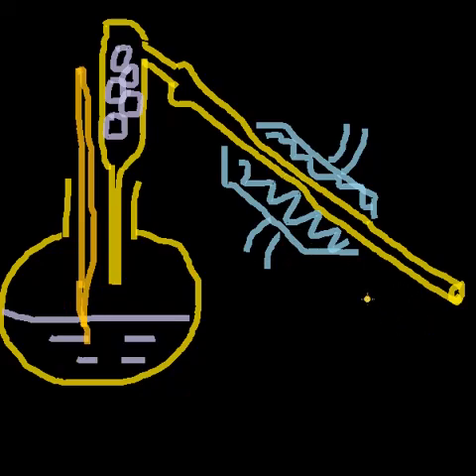And here we may have a container in which the drops of liquid after getting condensed can be collected.